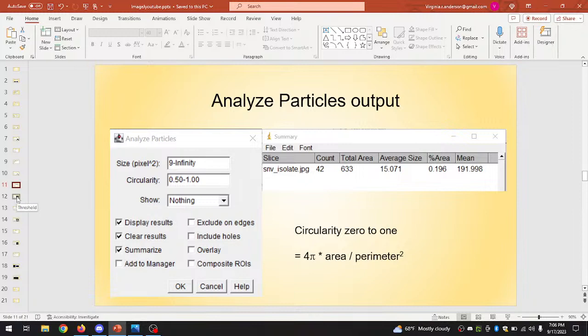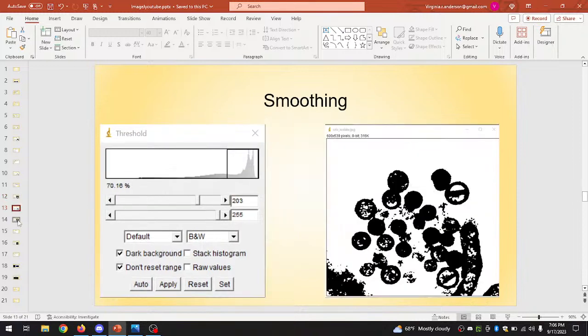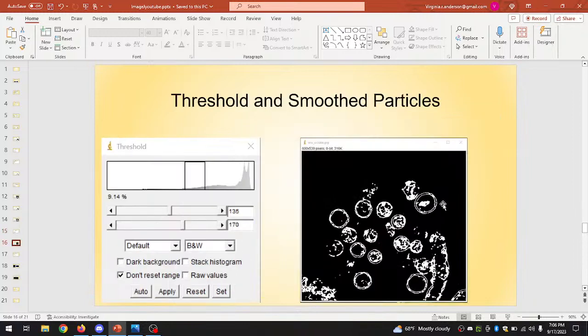And again, you can actually go into a mode where the particles in this picture are not easy. I deliberately chose a picture that was not easy, and make them so that you have white on black, which makes things, in this case, quite a bit easier. So playing with this, you can see there's a lot of things you can do, and when you analyze them, you can see what it thinks that this is one big blob of a dot, and that's usually, in most cellular cases, not what you want.